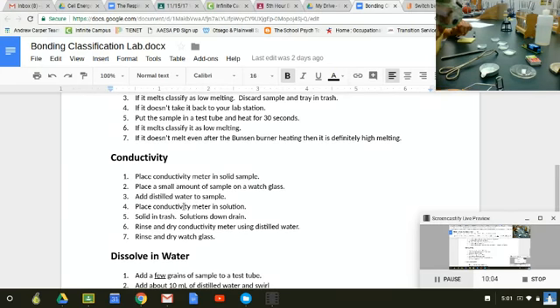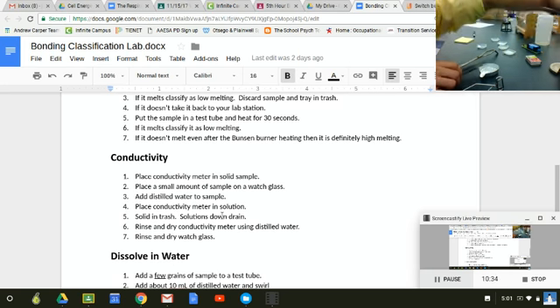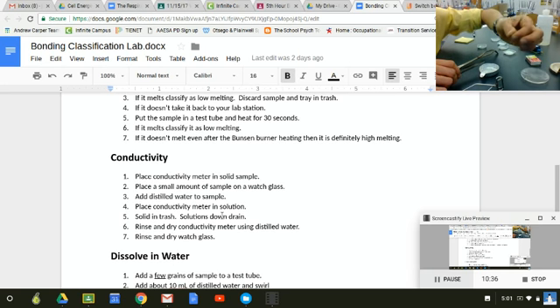All right. Then you put the solids in the trash and the solutions down the drain. So if you do have this silvery metal substance, don't throw that away because you need to keep this for your other tests. But any other substances you're not going to reuse because they're all powders and small substances. So none of these substances are toxic. You can dump the water down the drain, maybe holding the substance with your finger, and then take your substance and throw it in the garbage, unless you have the metal one.